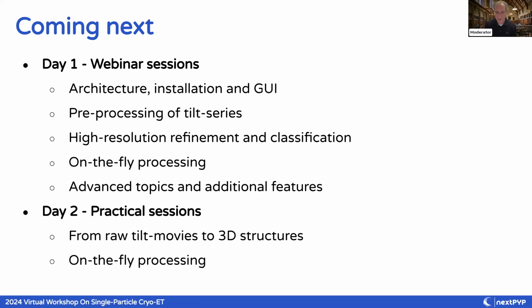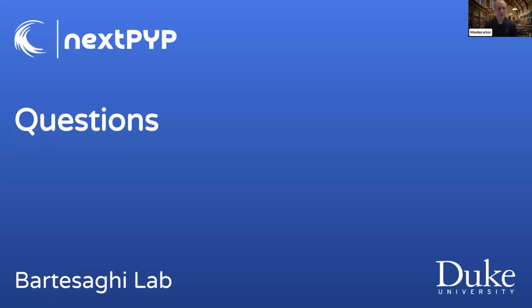One thing you will see is that at some point tomorrow during the practical, you're going to be able to produce a reconstruction from more than 3 million projections. So you're going to see how that scalability comes into play, and what the savings are in terms of storage and so forth. So I'm going to stop there and leave time for questions.